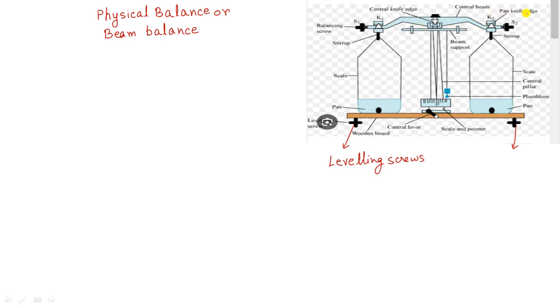This is the pan knife edge, which is also a prism. The pans hang on this knife edge. You also see the stirrup on which the pan is supported. These are the balancing screws S1 and S2. You can rotate these screws to move them left or right to get an exact measurement of mass.